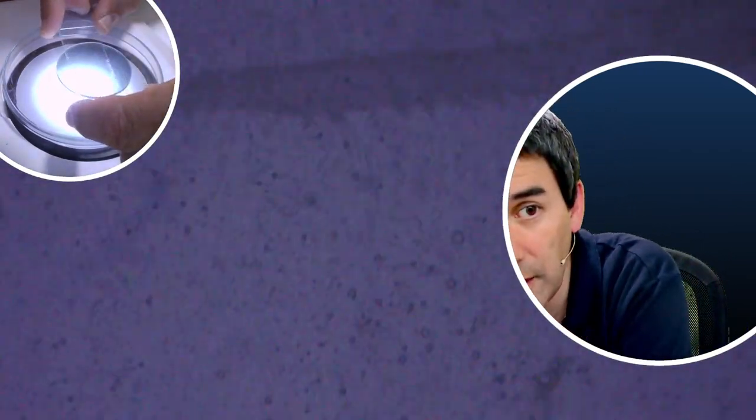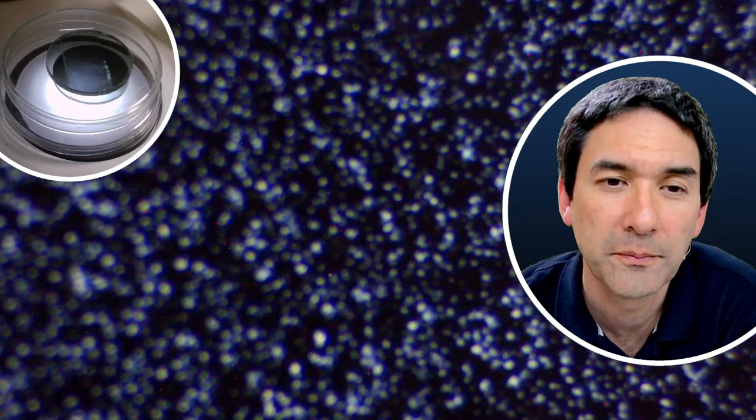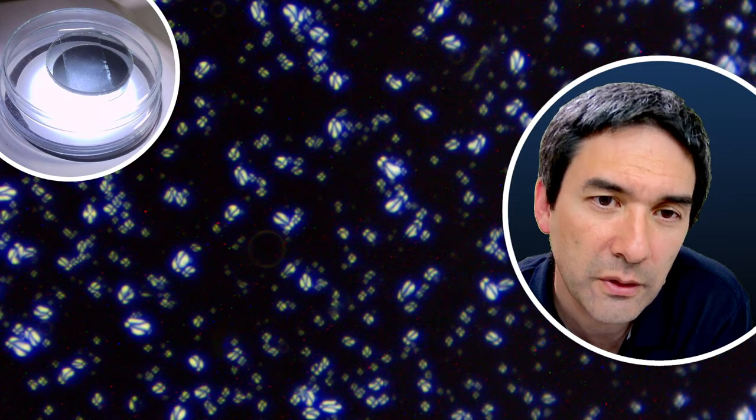So let's put it here again, and starch grains under polarized light. Actually, here they are. See, they're kind of tiny, so let's zoom in. Ah, this actually works. Let's focus. Yeah, it's still tiny. Let's go up a bit further. Let's turn up the light intensity a little bit. And let's carefully refocus them. Yeah, I can't get it any more clear. But here they are.